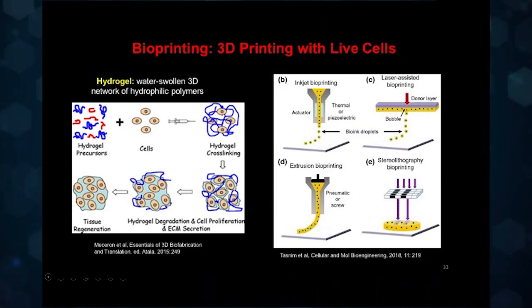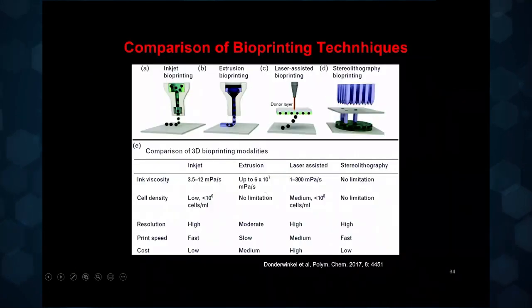the cells. And there's also laser-assisted bioprinting, which is sort of like inkjet bioprinting, but it's contactless. So there's a glass slide and a layer of this bio ink with the cells along with the bio ink. And when you shine the laser at a particular spot, this polymer will drop from there, and then that can be deposited at various positions. It's sort of similar to inkjet, except you don't make any physical contact, and there is no nozzle in this case. And each of these techniques would come with its own pros and cons.